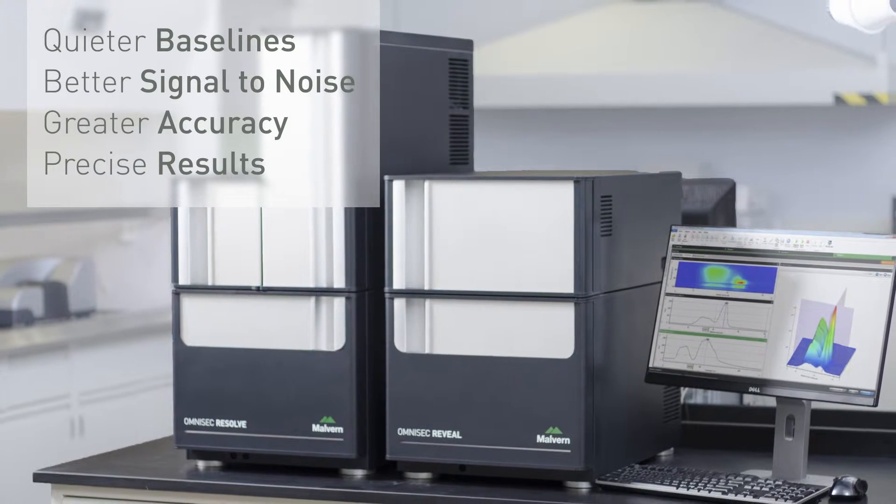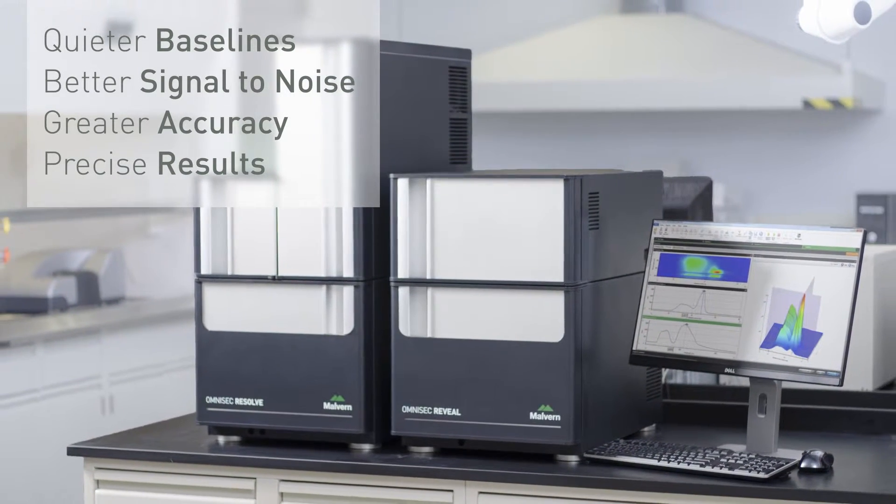Other areas where we made significant developments were low noise digital electronics, advanced signal processing, and great detector temperature control — all of which means quieter baselines, better signal-to-noise, and more accurate and precise results.